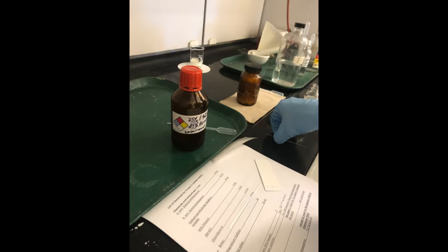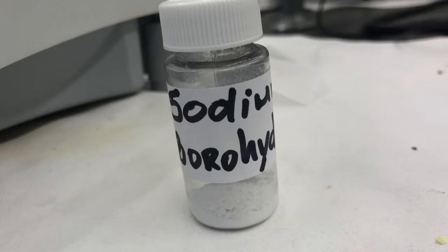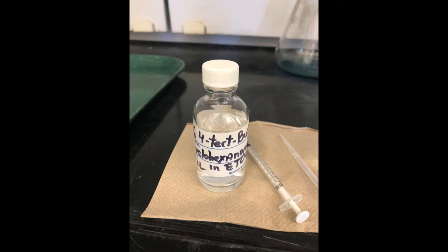The practice of oxidation and reduction reactions to synthesize products was used in this experiment to look at the diastereomeric ratio of a compound. Sodium borohydride was used for the reduction of 4-tert-butylcyclohexanone to produce 4-tert-butylcyclohexanol. HNMR was then used to find the cis and trans isomeric ratios of the product.